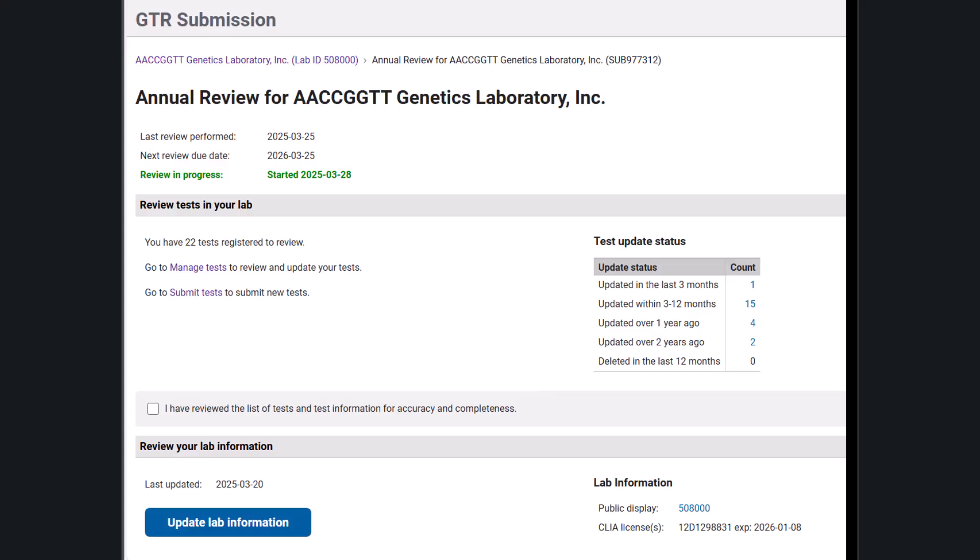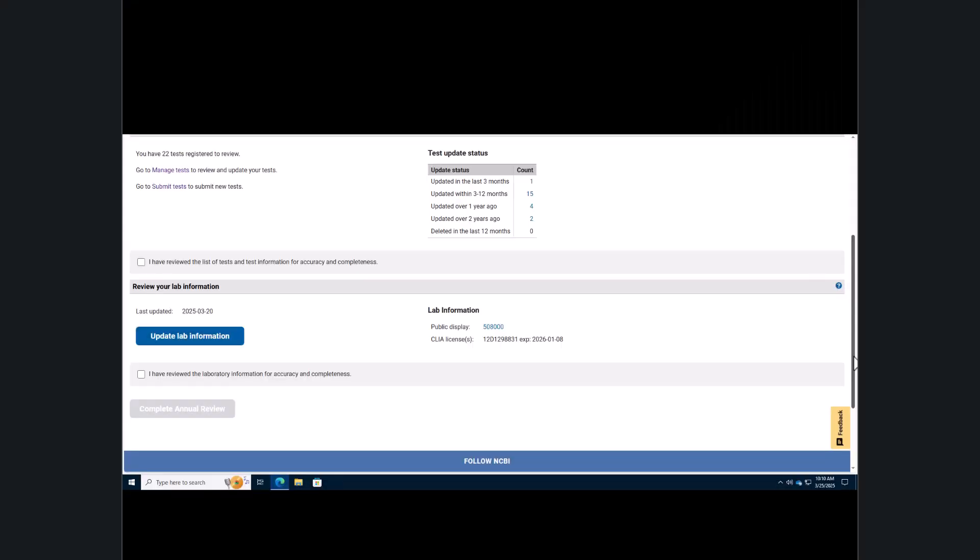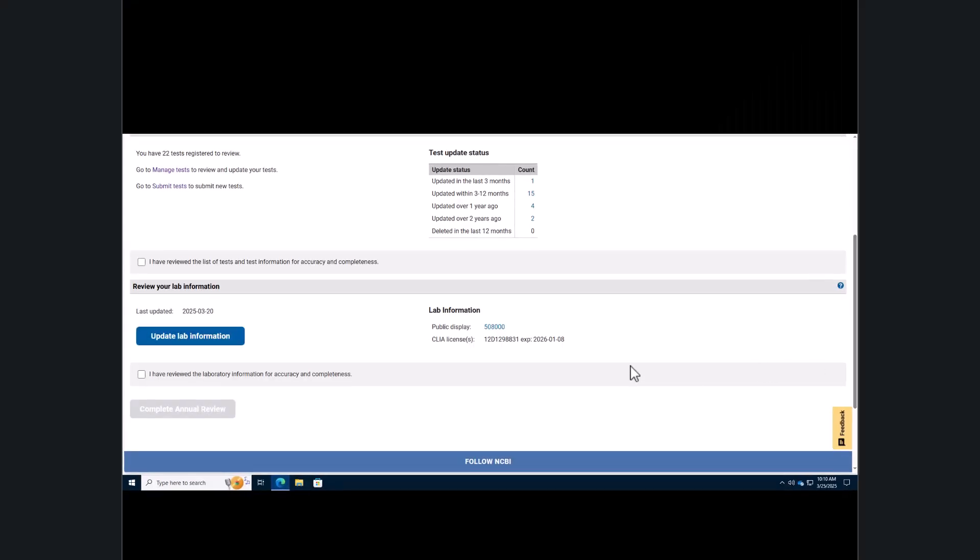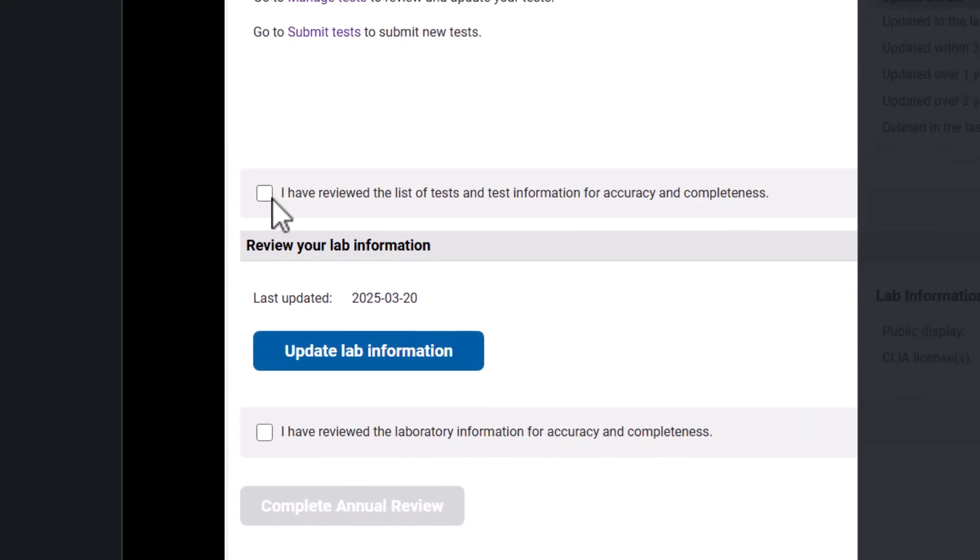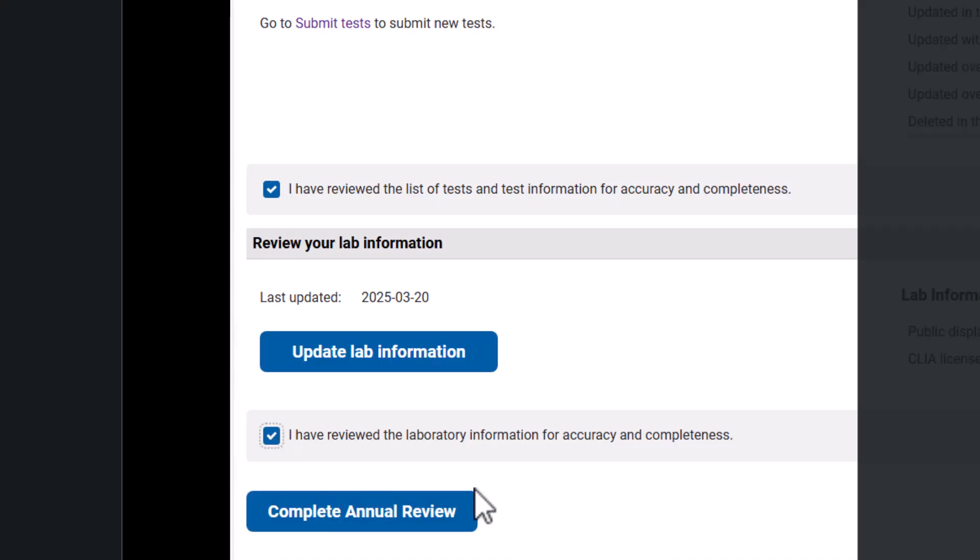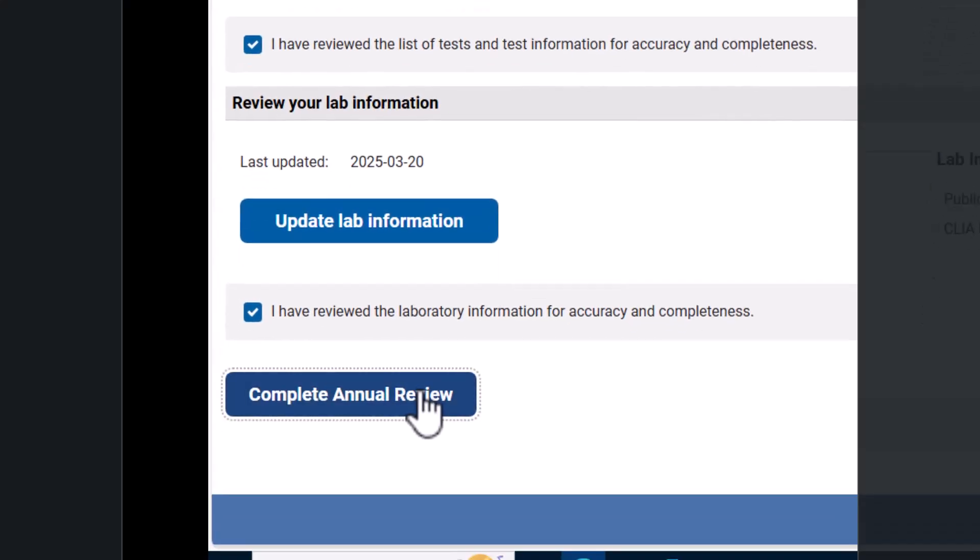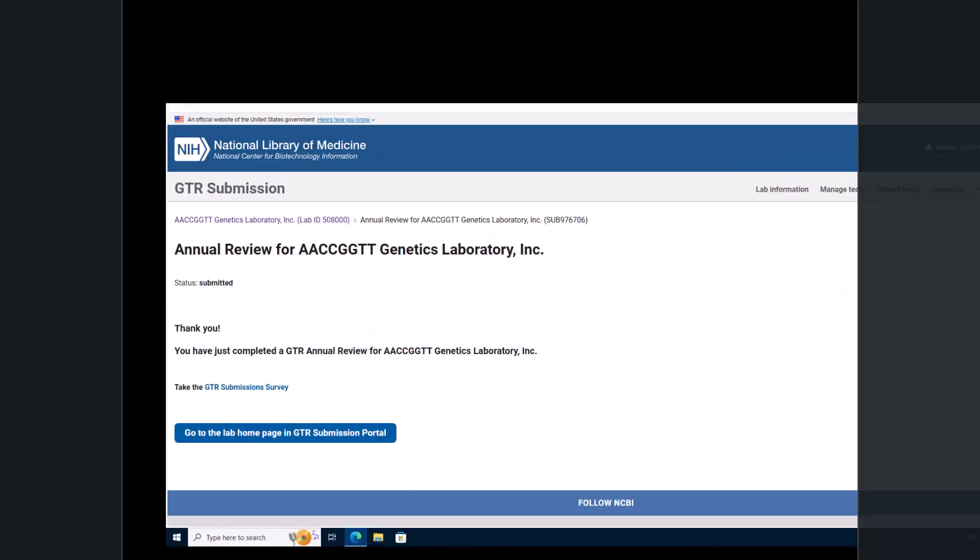On the annual review page, you can see some information about your data, the review statuses of your tests, and some information about your lab. If your laboratory and test records are up to date, check the box that reads, I reviewed the list of tests and test information for accuracy and completeness. Then check the box that reads, I have reviewed the laboratory information for accuracy and completeness. Click the complete annual review button and you are finished with your annual review.